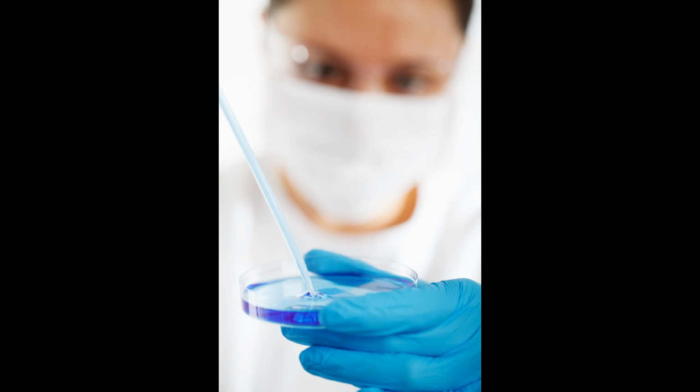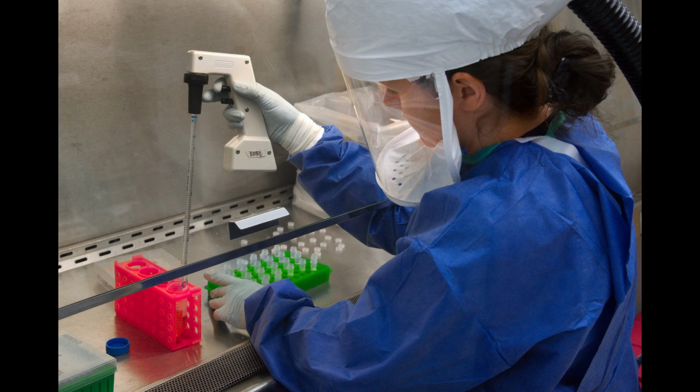The final level is Biosecurity Level 4, and this is perhaps most often the image portrayed in Hollywood films. Blow-up jumpsuits, full helmets, and hooked up to an oxygen supply. All of this is to create an environment in which the researcher is completely isolated away from the things which are being worked with, and in doing so they are protected from what is being worked with or on.